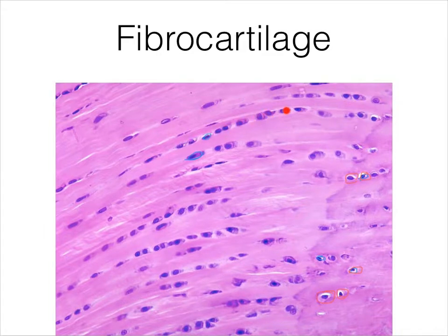That has to do with how they reproduce around the collagen fibers. The collagen fibers tend to pack all of these related cells together in the same sort of line area between the fibers. So look for these lines of chondrocytes in lacunae to identify fibrocartilage. But if you see big, strong collagen fibers with chondrocytes in lacuna, it's probably fibrocartilage.